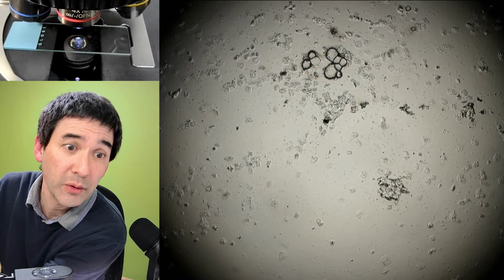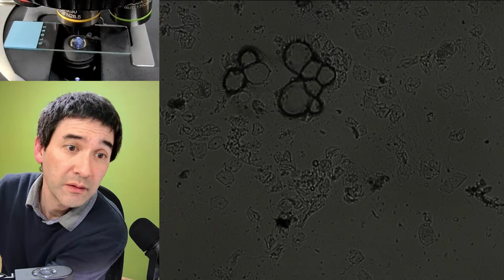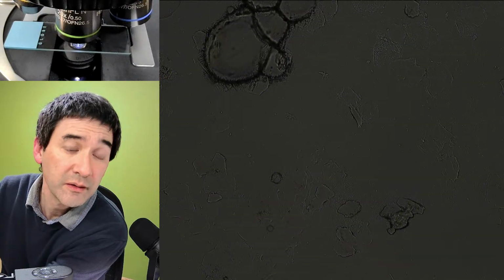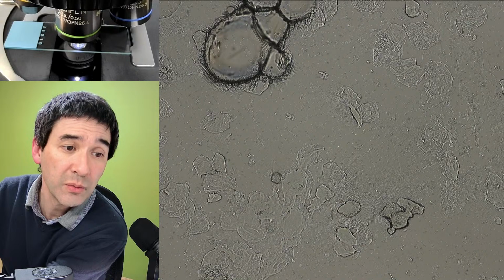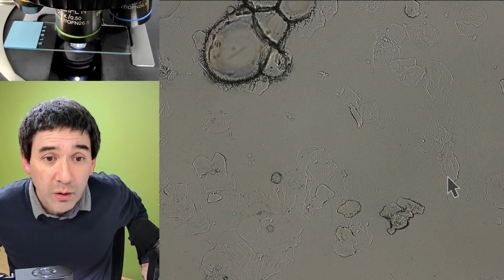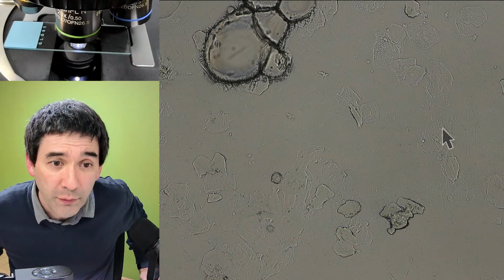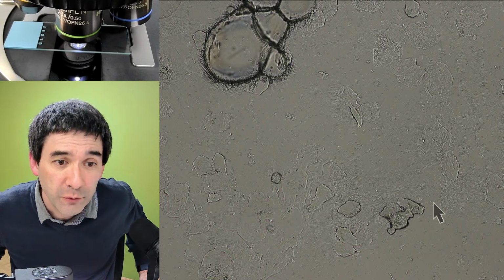And here we go. Okay. Yeah. Of course, lots of epithelial cells. So in case you want to know what we see here is all of those things here. These are all cells from my mouth. Bacteria probably scattered in between here, too difficult to see.